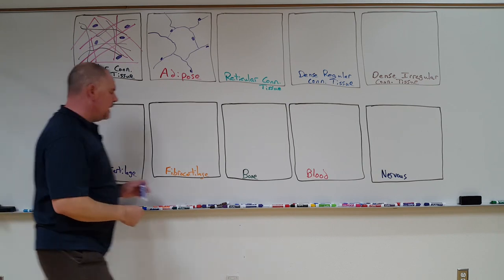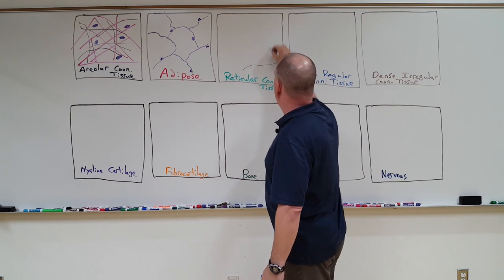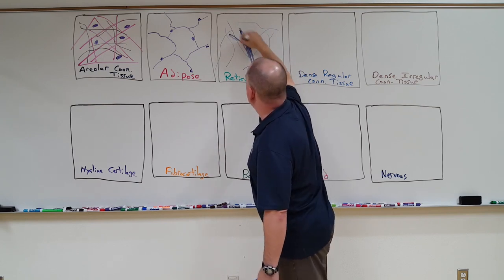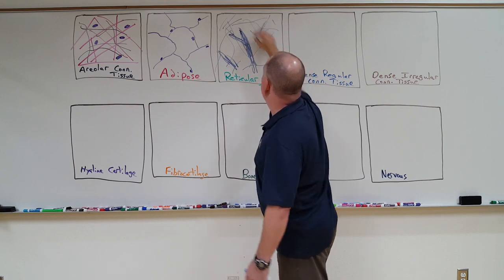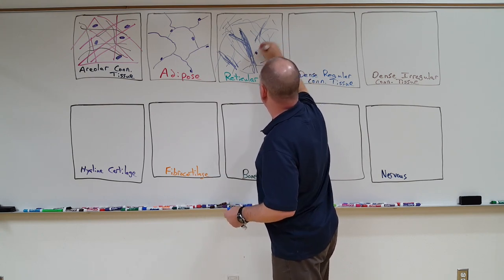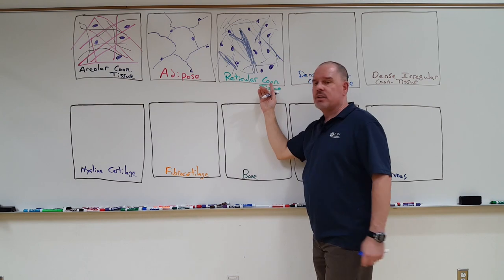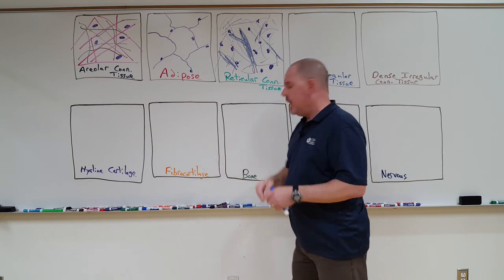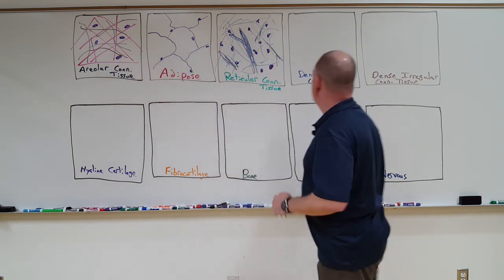Reticular connective tissue, famous for being dominated, of course, by this irregular network of reticular fibers, often collecting in large bundles of reticular fibers, often stained blue or violet in color, with usually a whole bunch of cells, but still widely spaced. Don't confuse reticular connective tissue with areolar. A little bit of similarity, but rewind and watch the video. I think you'll see they're not that similar. You won't see those big collagen fibers as you do in areolar connective tissue.